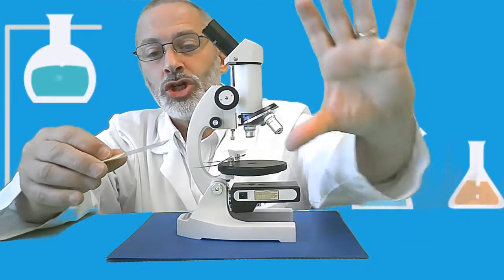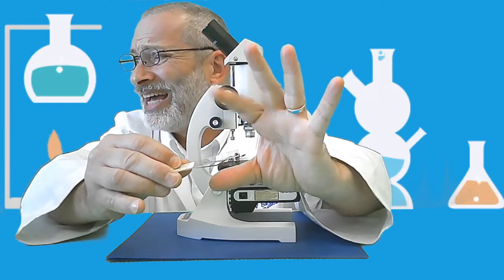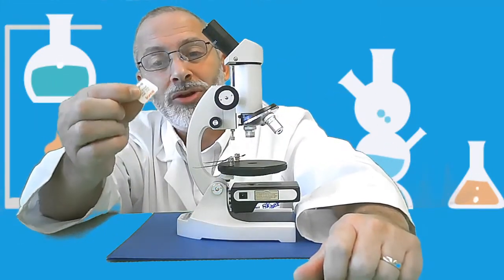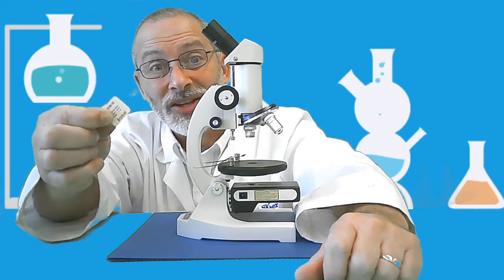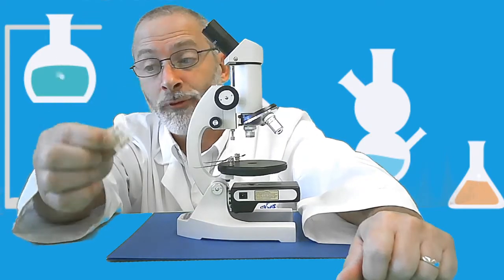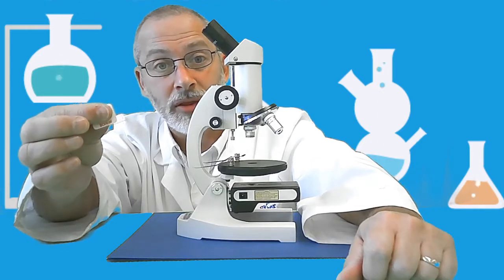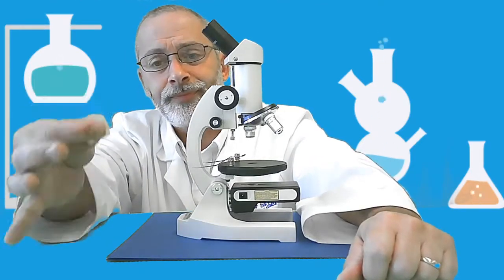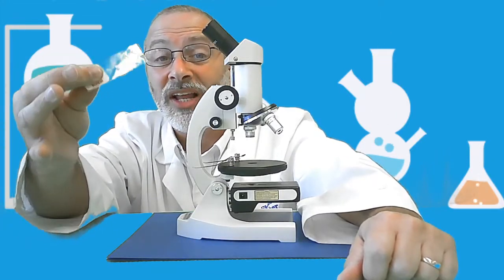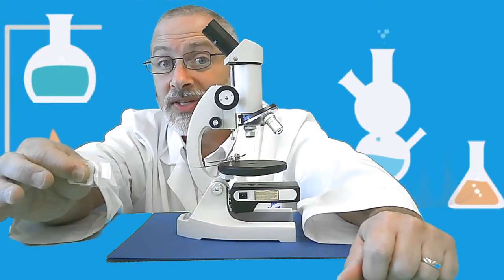Very good. Should we ever grab onto the top and bottom of a slide? Please say no. But rather you get the slide by the side so your grubby fingerprints don't smear and smudge the specimen that we're looking for. Many of the slides we'll be using actually have labels on them. I'm not going to show you this label because then I'll give you the answer. But you can hold on to the side of the slide with the label on it. That would be great because then you're not smudging anything that you need to see.